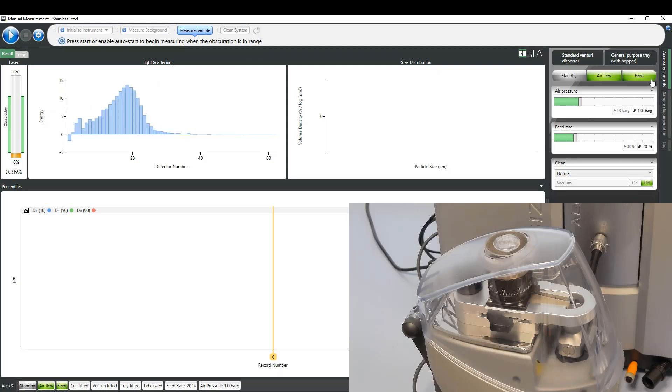At the same time, we can see the live scattering data and the particle size result of our metal powder.